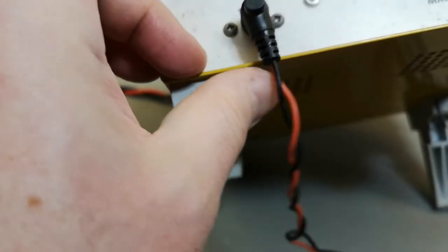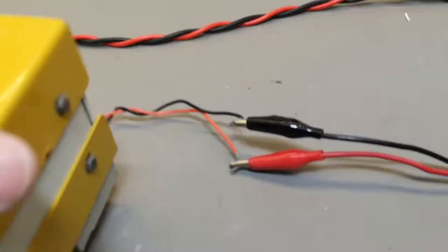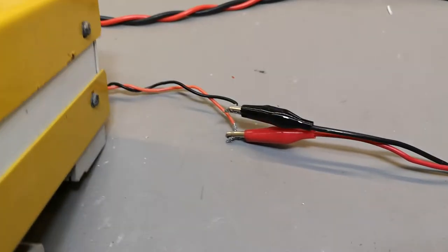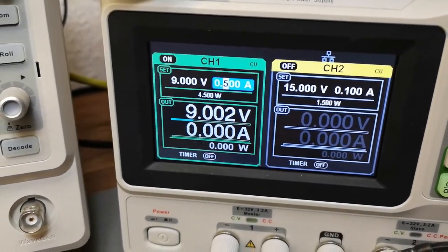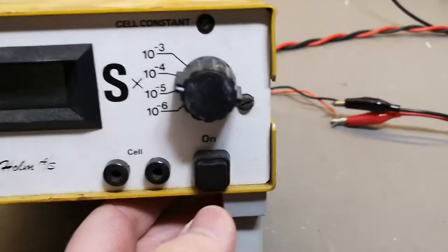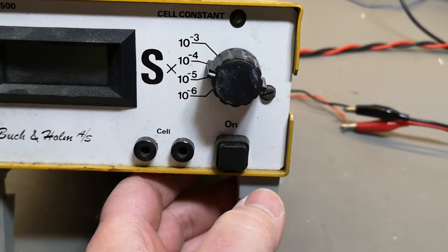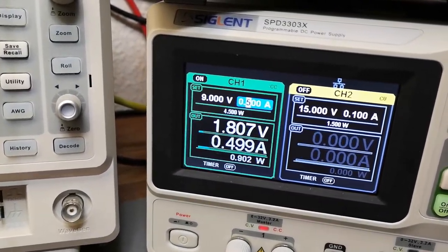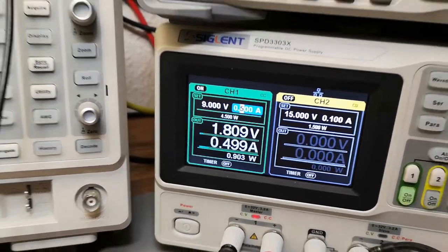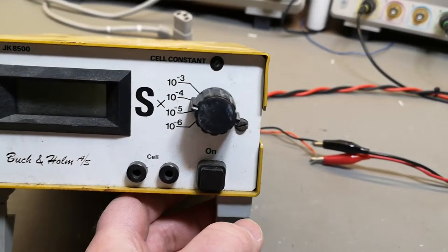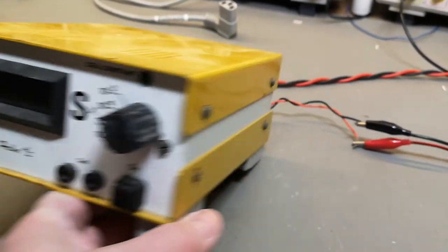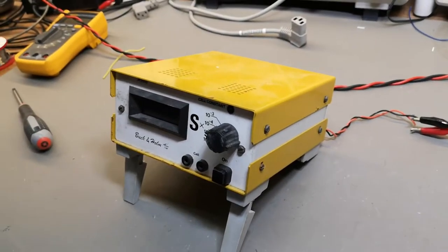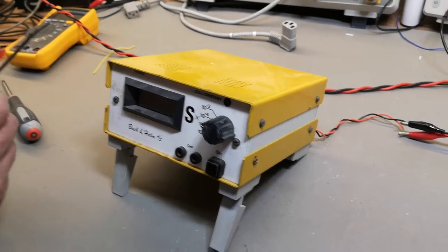So we just assumed it was center positive and gave it nine volts as they said. We limited the power supply to 500 milliamps and pushed the button. Then it goes 1.8 volts and 500 milliamps, so there's definitely a short, or this is wrong, or maybe we turned this wrong. It's time to open this thing.